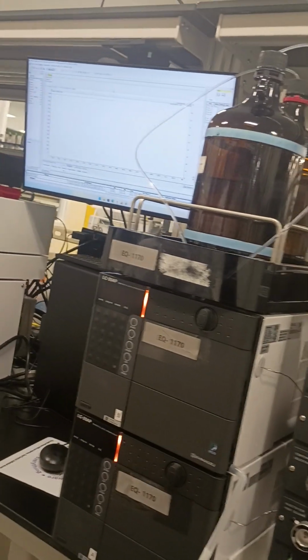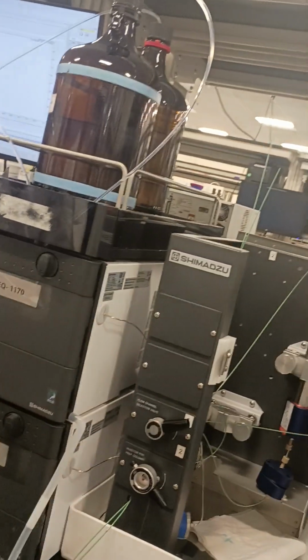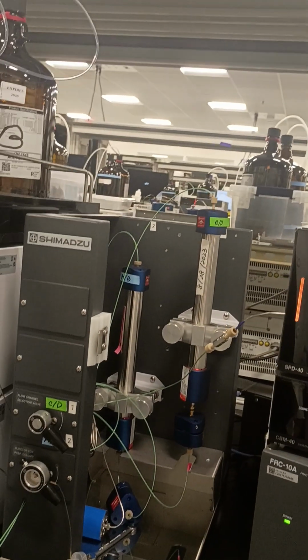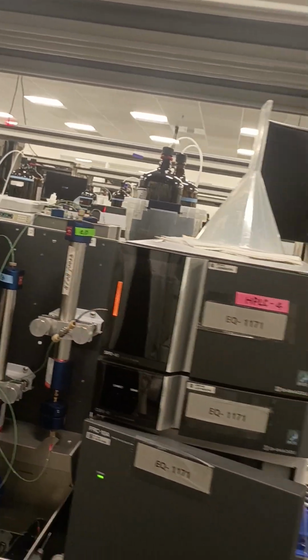Now, if it's on, that's when you have to worry about trying to turn it off. But if you're not sure, you can always call me or call HIP or call anybody in the lab, just to make sure. So every night, this is how it's supposed to look when shut down: it's supposed to look orange. If it looks green, that means something is running.